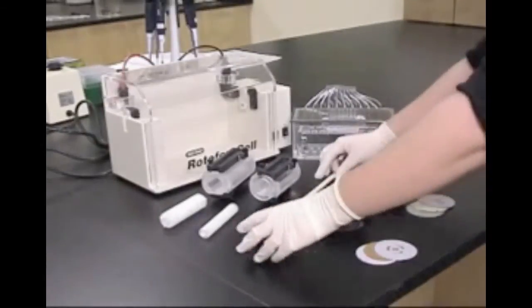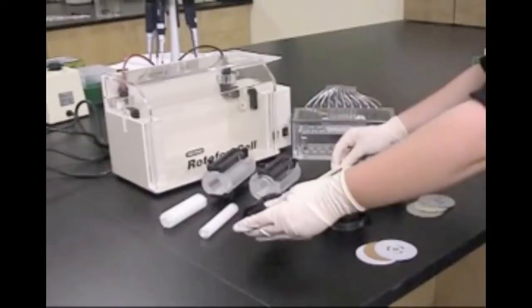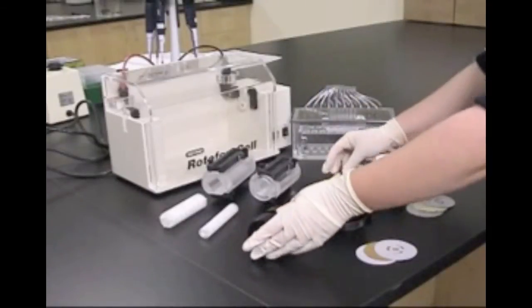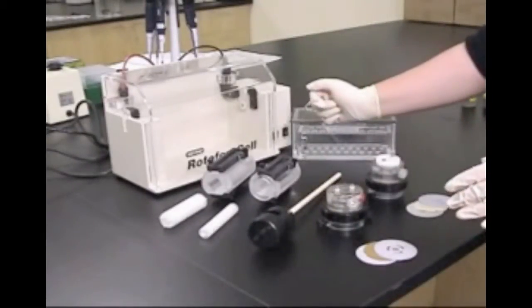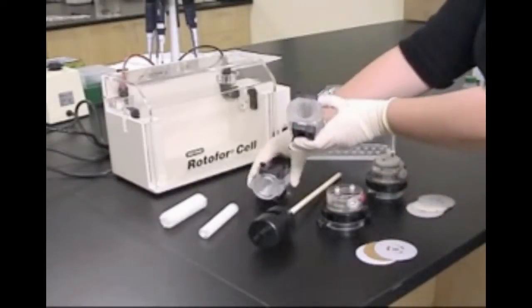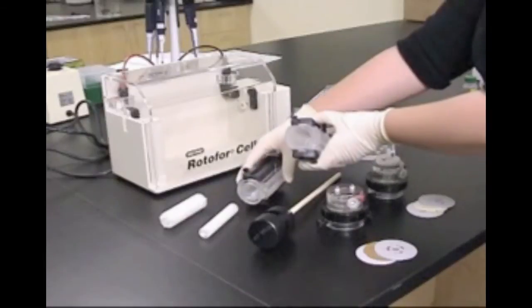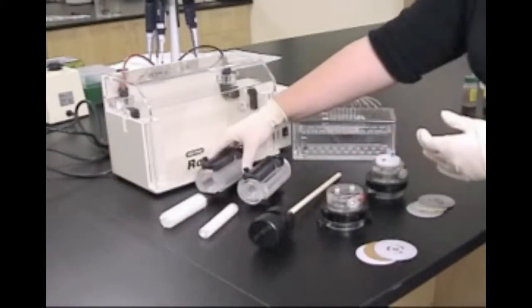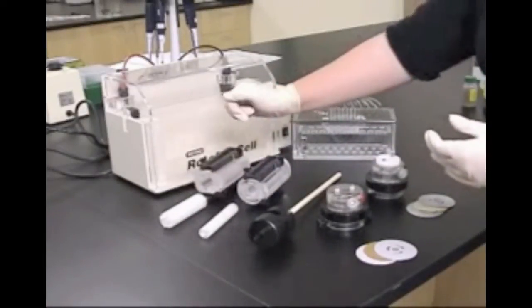All of which are assembled around a central ceramic cooling finger. The Rotifor system provides two different but interchangeable focusing chambers. The standard chamber, which holds 35 to 60 milliliters of sample, and the mini focusing chamber, which has a smaller internal diameter to hold 18 milliliters of sample.